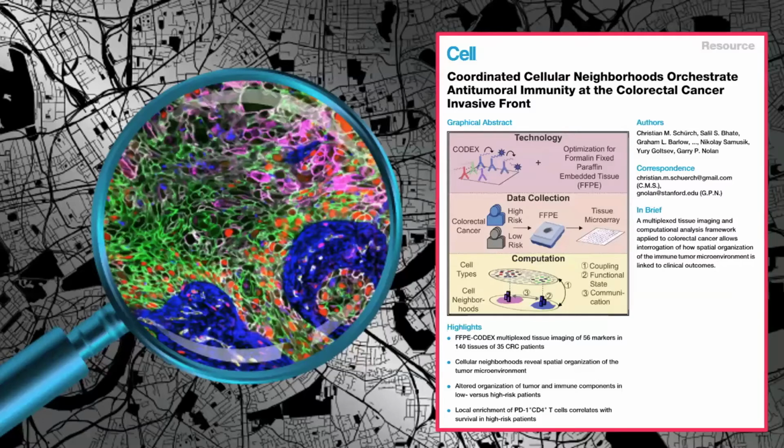So you can do cell phenotyping just like you're used to from all the other applications that we see nowadays. But now, instead of just knowing which cells are there and how many cells are there, you can ask all kinds of new questions, like who are they neighboring, how may they interact, and ultimately, how could this affect or relate to a patient outcome or a certain type of disease.